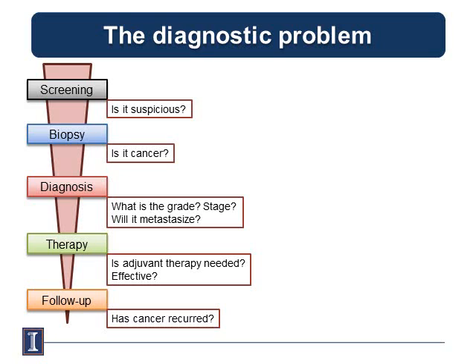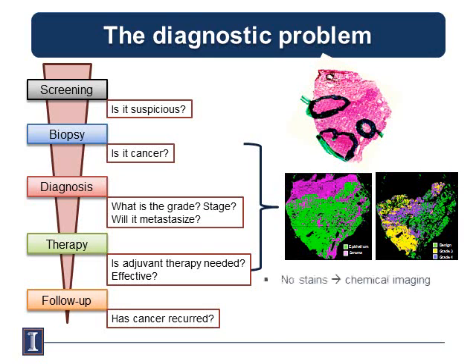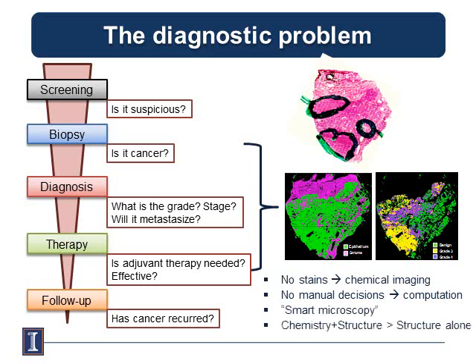What my lab has done is focus on each of these problems and try to build solutions based essentially around looking at microstructure and microscopic compositional changes. The clinical gold standard pretty much relies on taking a piece of tissue from the human body, slicing it thin, putting it on a glass slide, and putting some dyes in it. Then a pathologist goes in and circles and says, here's a cancer, and this is normal tissue. So in a nutshell, what we try to do in our lab is use IR imaging and image this unstained tissue.